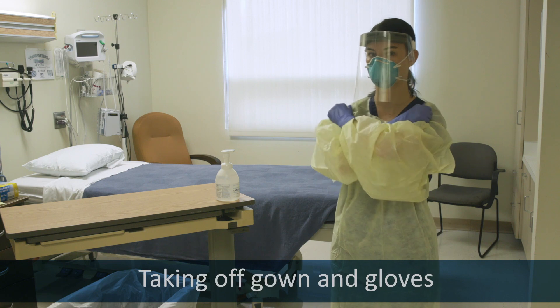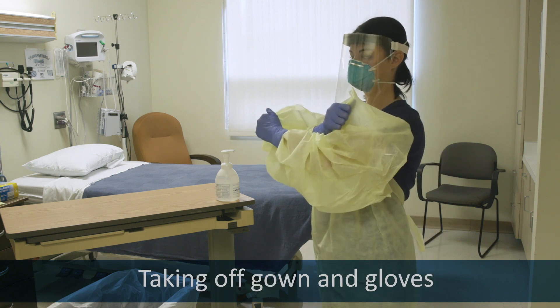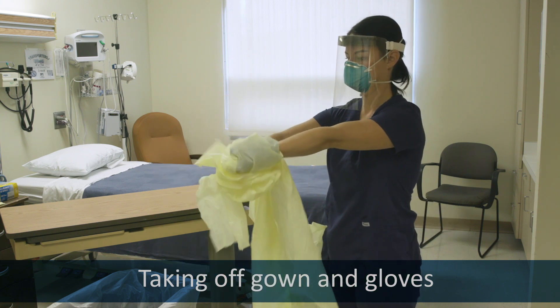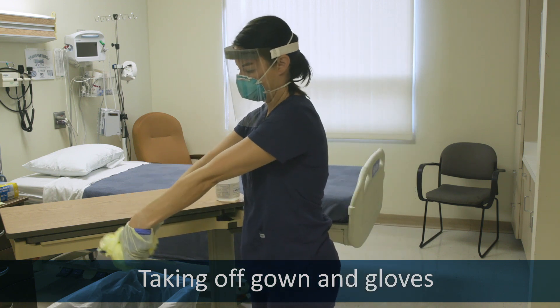To remove the gown, cross your arms and grab the shoulders of your gown. Pull until you feel it break, then roll it away from you into a ball and over your hands until you remove the gloves.